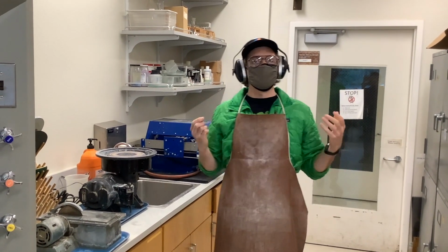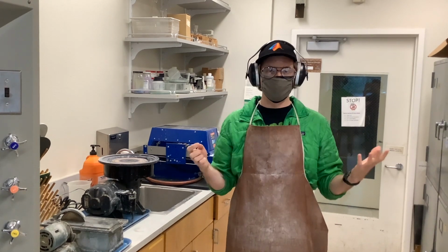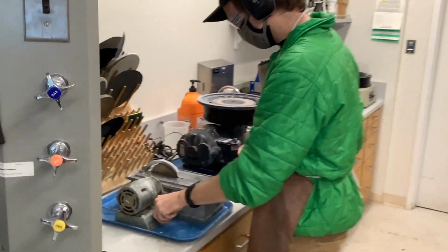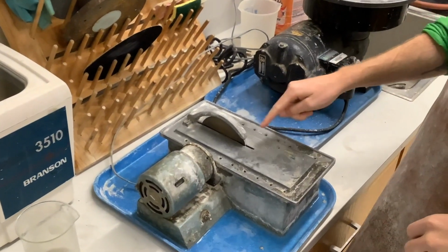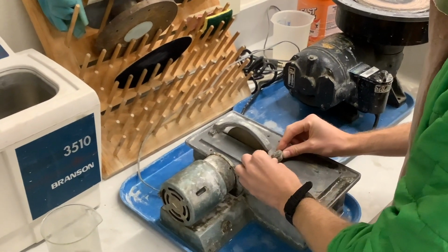Once we get this on the saw and get a piece cut out of it, we can look at our sample more closely and identify where we want to subsample from there to move on to our isotopic analyses. You can see the water dripping out here, so that's keeping the saw cooled and lubricated. And now we'll send the rock to its fate.